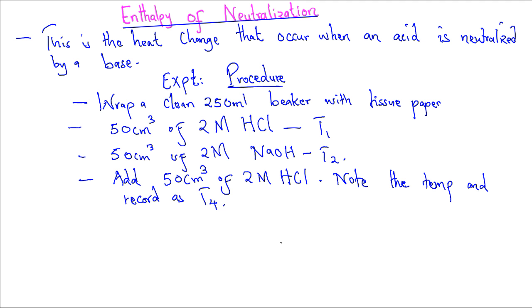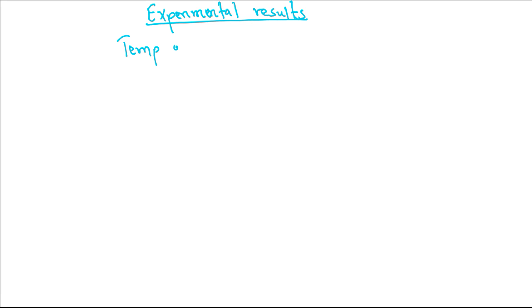Experimental results. Temperature of HCl, T1, is equal to 22.5 degrees Celsius.